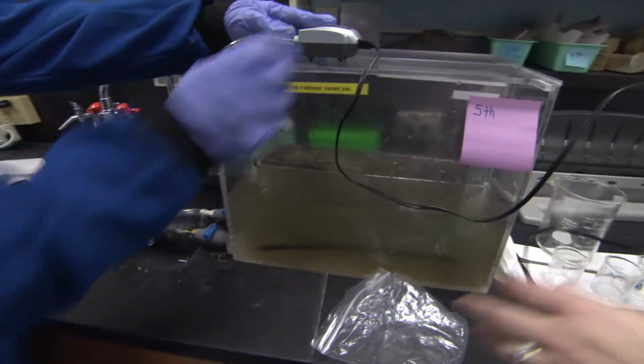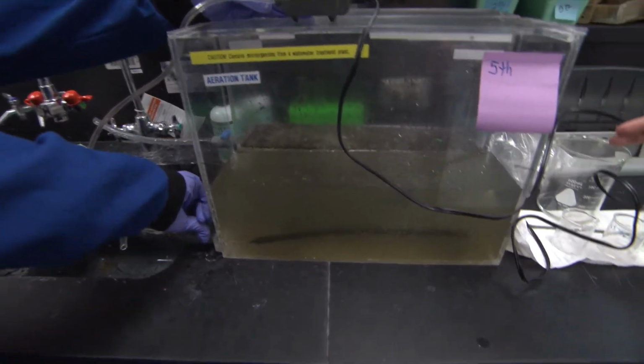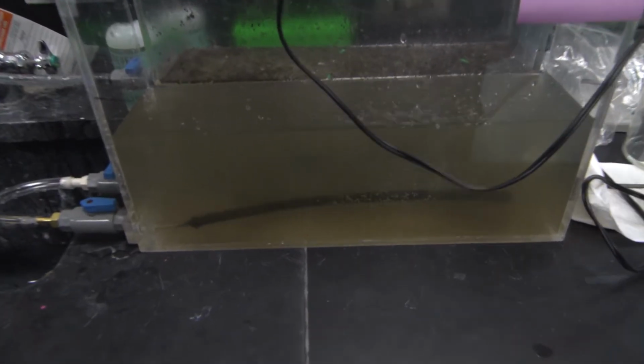The little bubbler is now on, and if you look behind, can you see the bubbles coming off of the bubbler? Yes. Now the microorganisms are happy. So we're going to let them work, removing nutrients and other organic matter, such as ammonia, sugar, protein, and carbohydrates, the things we added in the very beginning while we made our wastewater. These microorganisms use the food for themselves, removing it from the wastewater for us, making it a win-win.